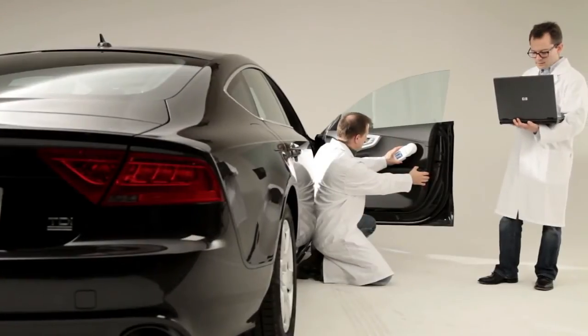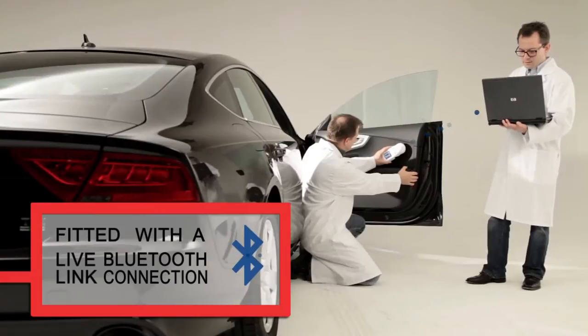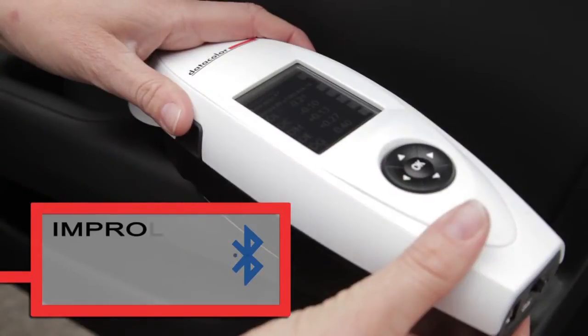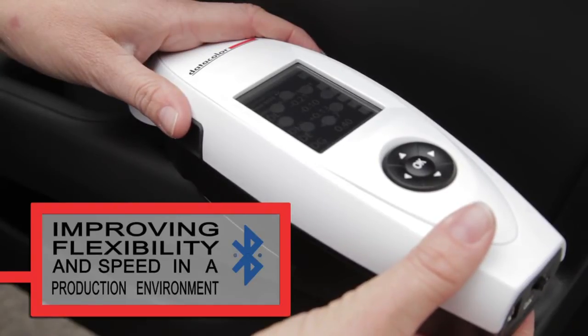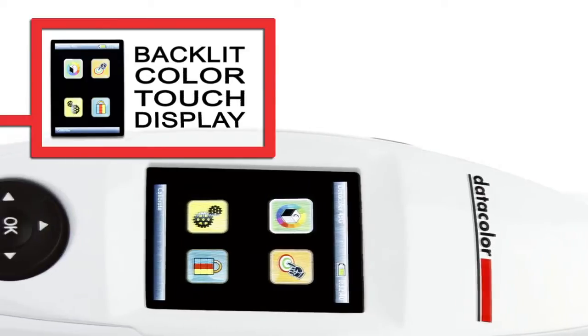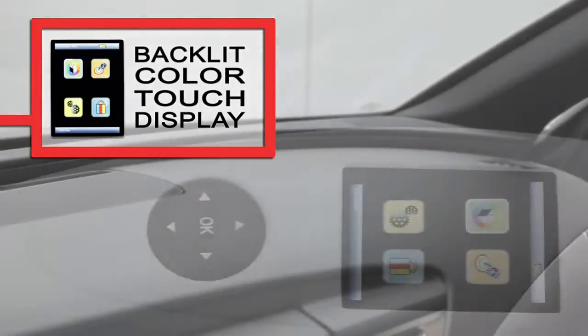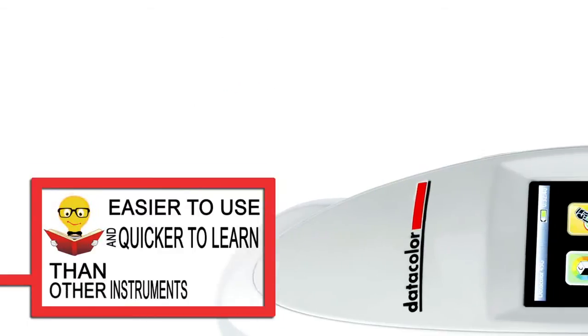To make the instrument even more versatile, it has been fitted with a LiveLink Bluetooth connection that allows wireless connectivity between the 45G and a workstation, greatly improving the flexibility and speed when using the instrument in a production environment. The backlit colour touch display makes it easy to read the measurement result and provides an intuitive workflow, making the 45G easier to use and quicker to learn than other instruments.